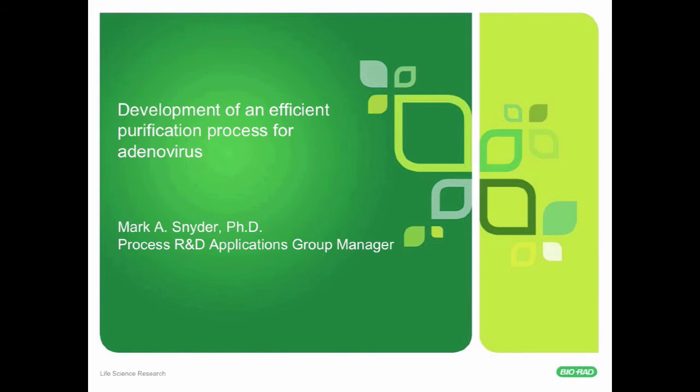Well, thank you very much, Peter, for that kind introduction. I'm excited today to talk to everyone who's listening about two different uses for mixed-mode resins. One is going to be purification of an adenovirus, and the other is going to be purification of a bacterial surface protein. So without any further ado, let's get started.